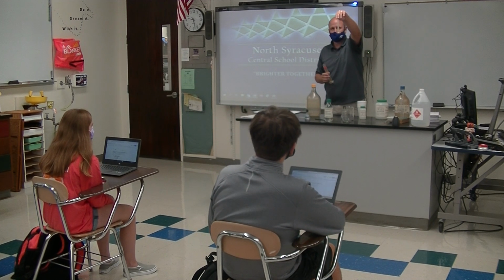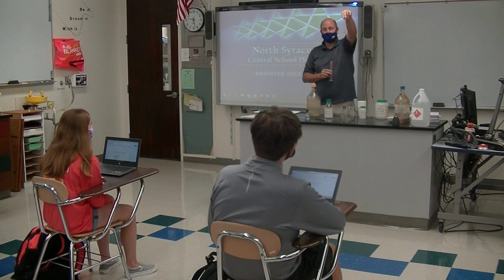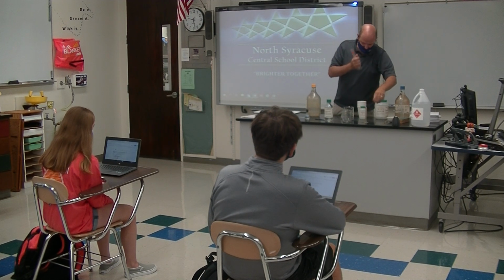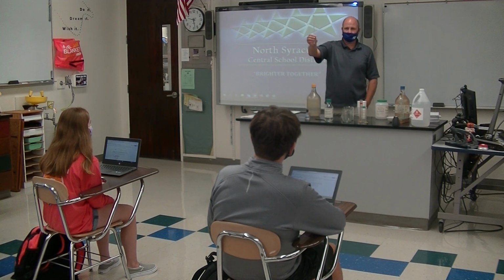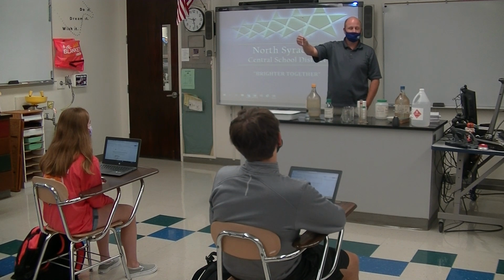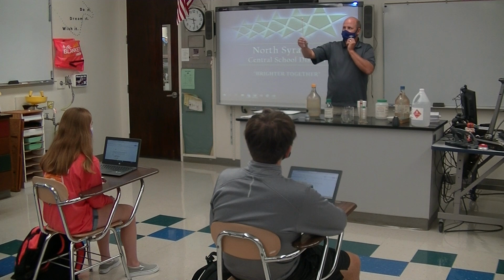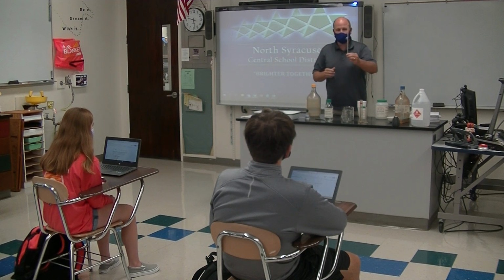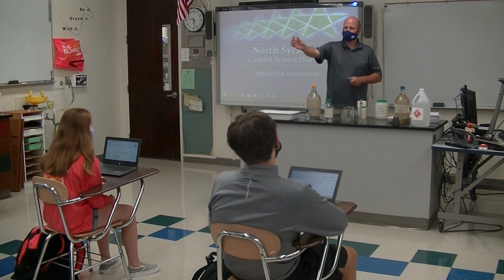What is this? Graduated cylinder. Thank you. Wow, good. What's this? You guys ever seen one of these before? This is a thermometer. All right, it's a thermometer. So what are thermometers used for? Measure temperature.